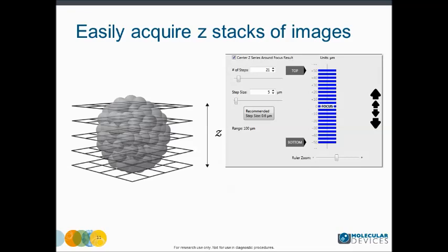Often when interrogating a 3D spheroid, multiple images of the object are taken in different vertical z-planes. Here I show a screenshot of the Z acquisition window in MetaXpress software. You set up the number of planes and step size for each wavelength, and the total range or height of your stack is calculated here. The ruler and the spaces for entering the number of steps are interactive.